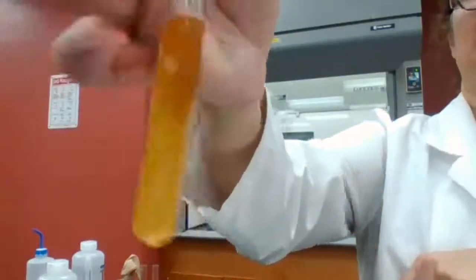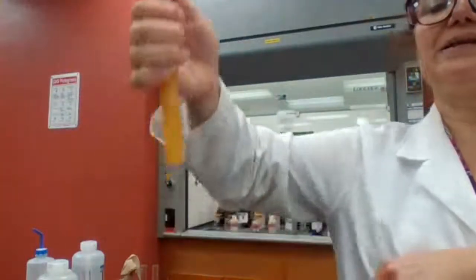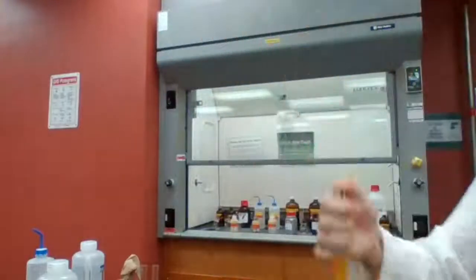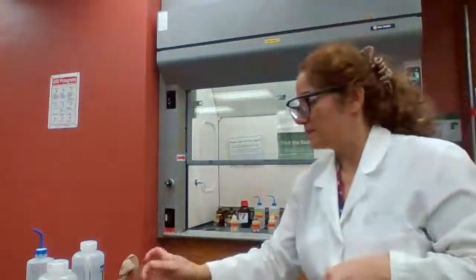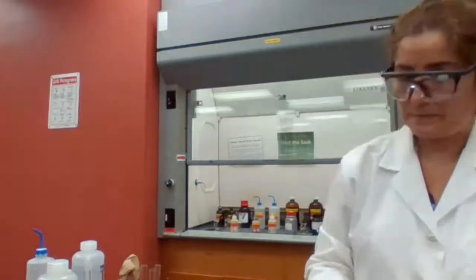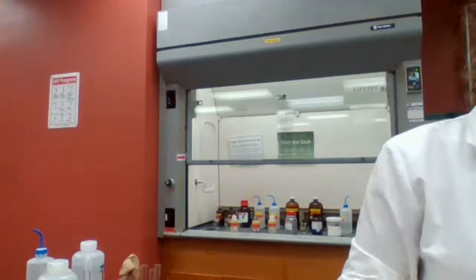If you don't have your lab reports written already, you can add it. This is the iodoform for acetophenone from yesterday. Positive test. Yes, it is a positive test. Okay.